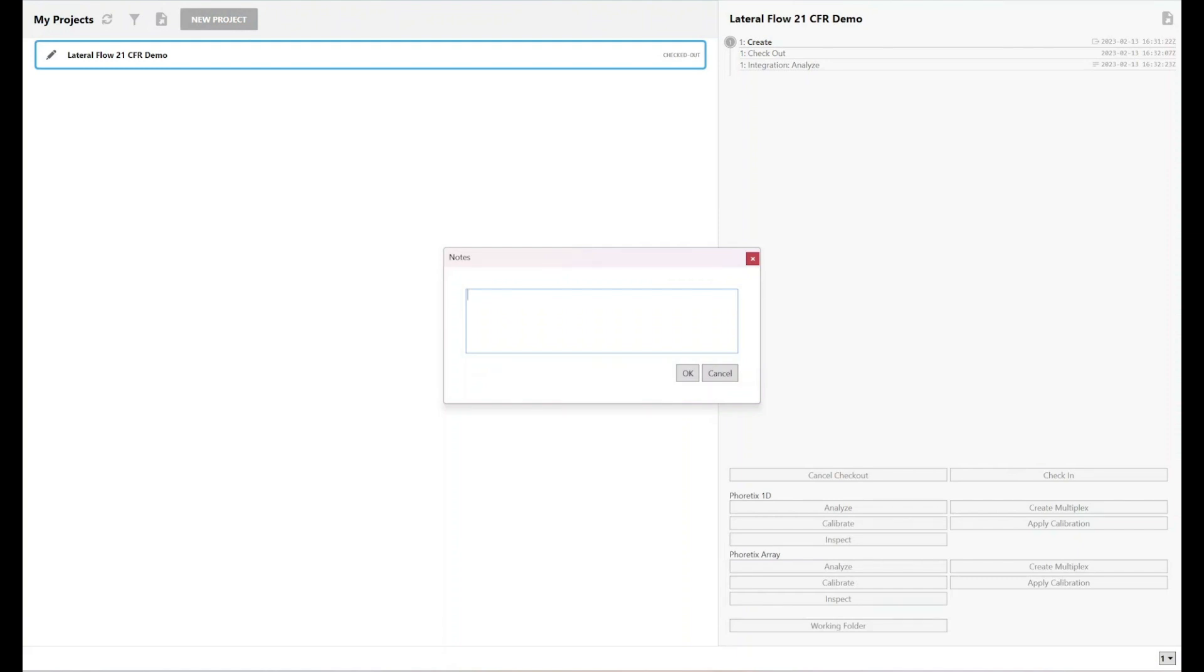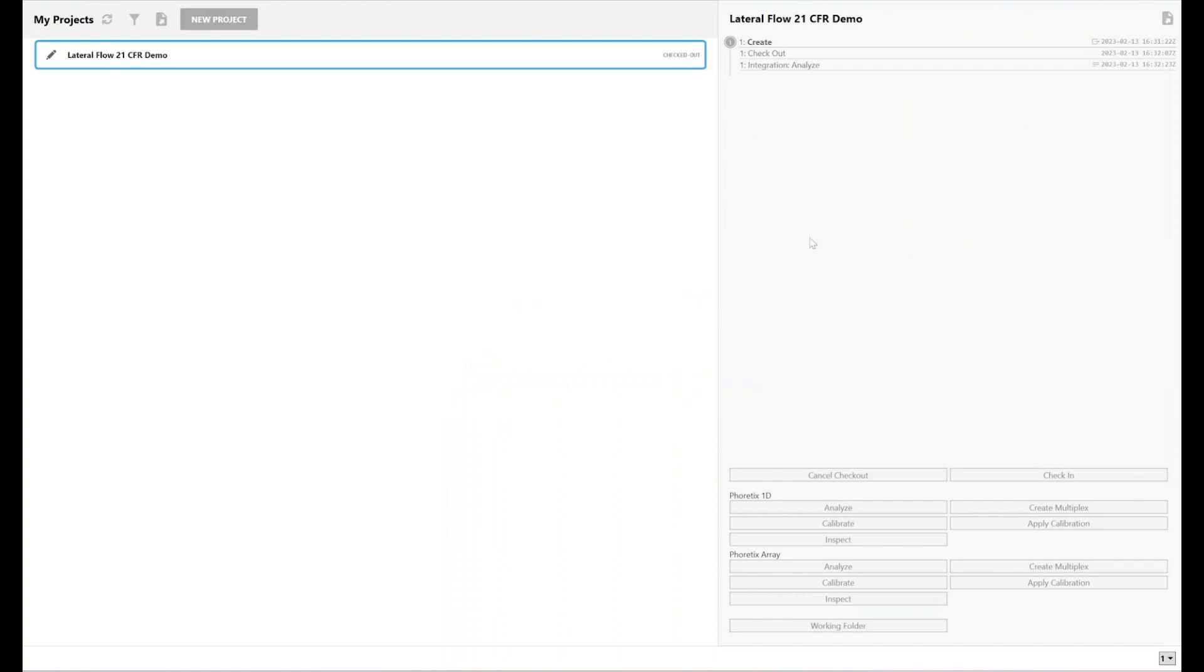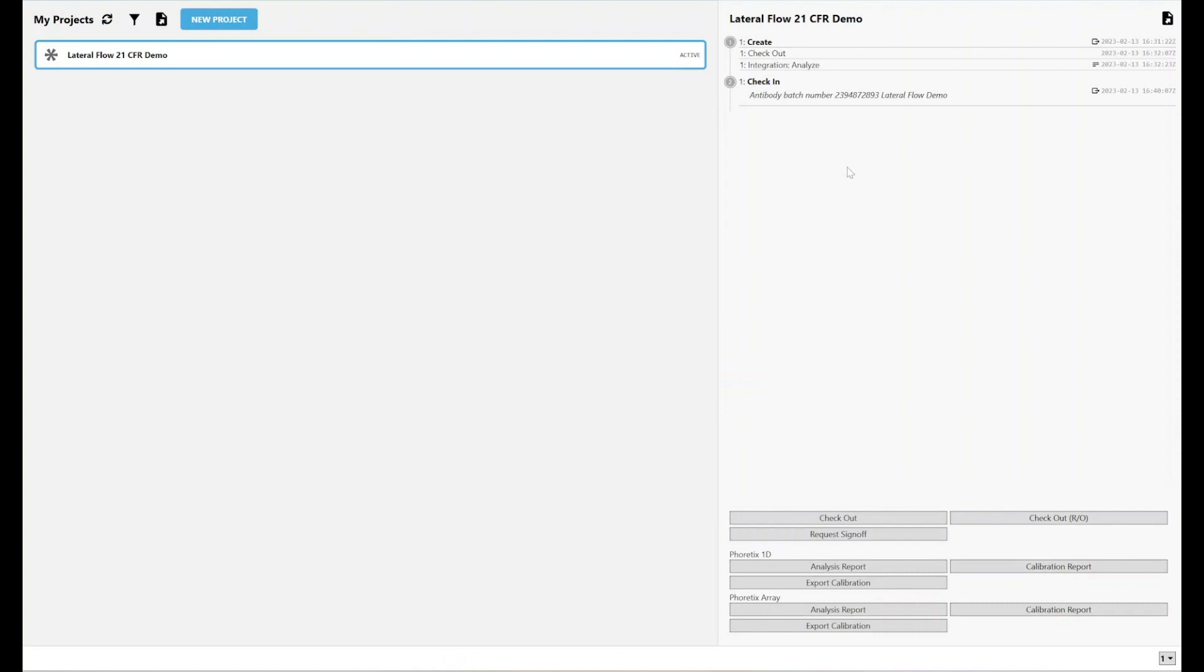At which point, I can add any notes for analysis. I'm going to add some notes this time just to show you how those appear in the audit trail. Antibody batch number lateral flow demo. There we go. Click on OK.